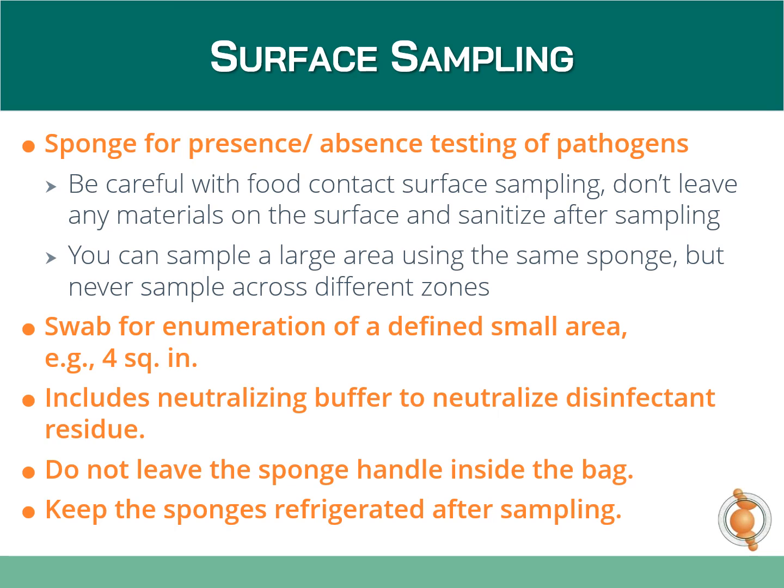Sample collection sponges and swabs should contain a neutralizing buffer to neutralize any disinfectant residues left from sanitation. Do not leave the handle in the bag. The handles should be removed from the sampling sponge aseptically.